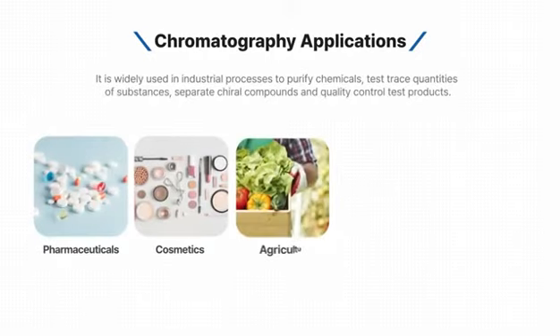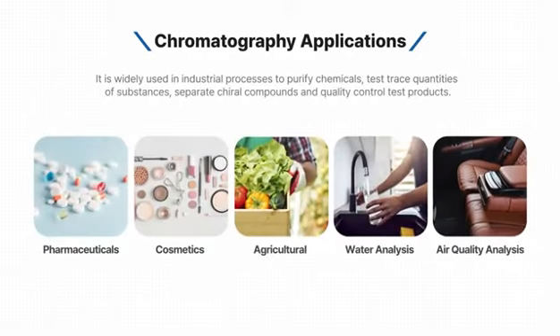Chromatography is widely used in industrial processes to purify chemicals, test trace quantities of substances, separate chiral compounds, and quality-control test products.